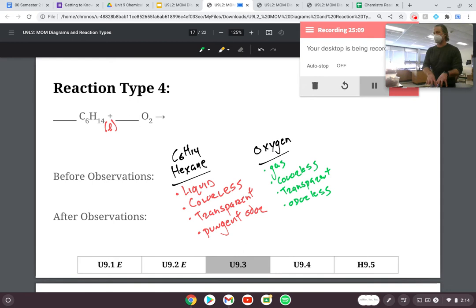It is, but I can make this burn. It's what's referred to as fire retardant. That means that it will burn. It will just take a lot longer for it to happen. Does that make sense? So the truth of the matter is that I can make this burn. Why did the hexane burn, but not the tabletop?